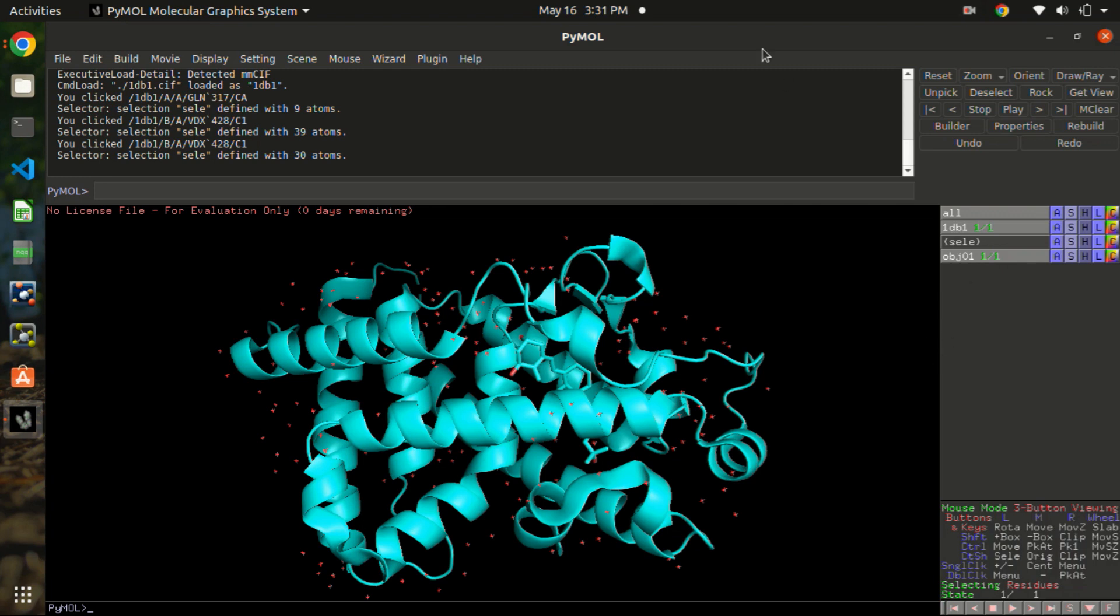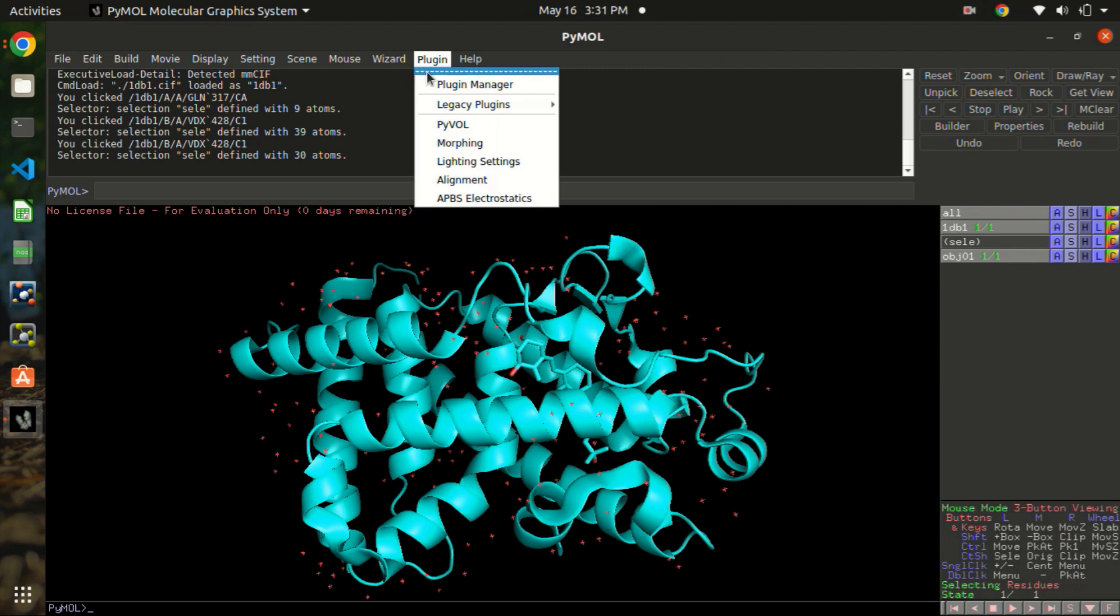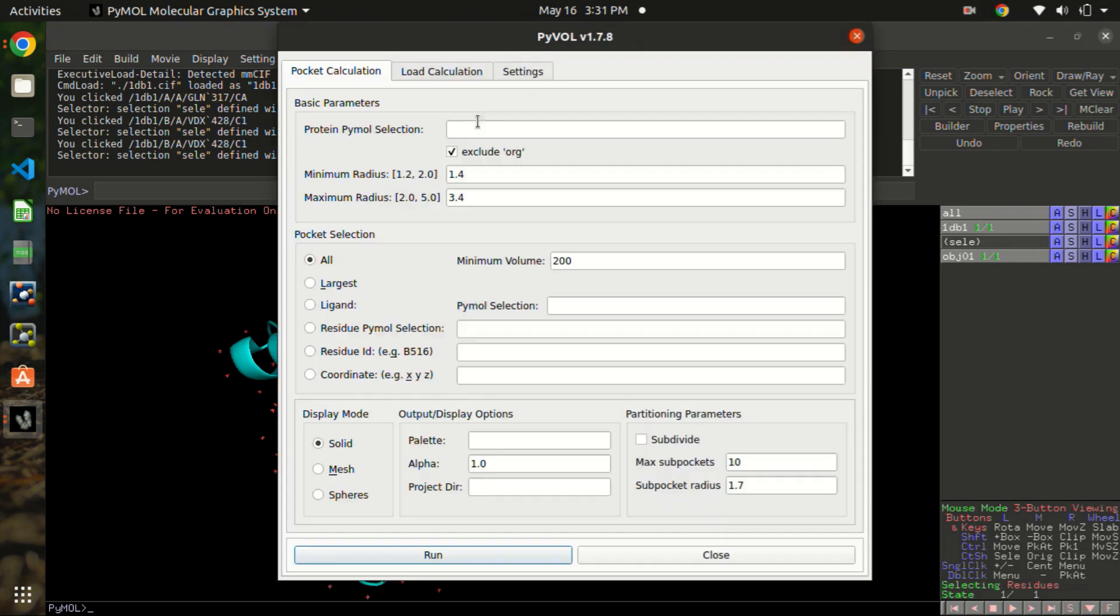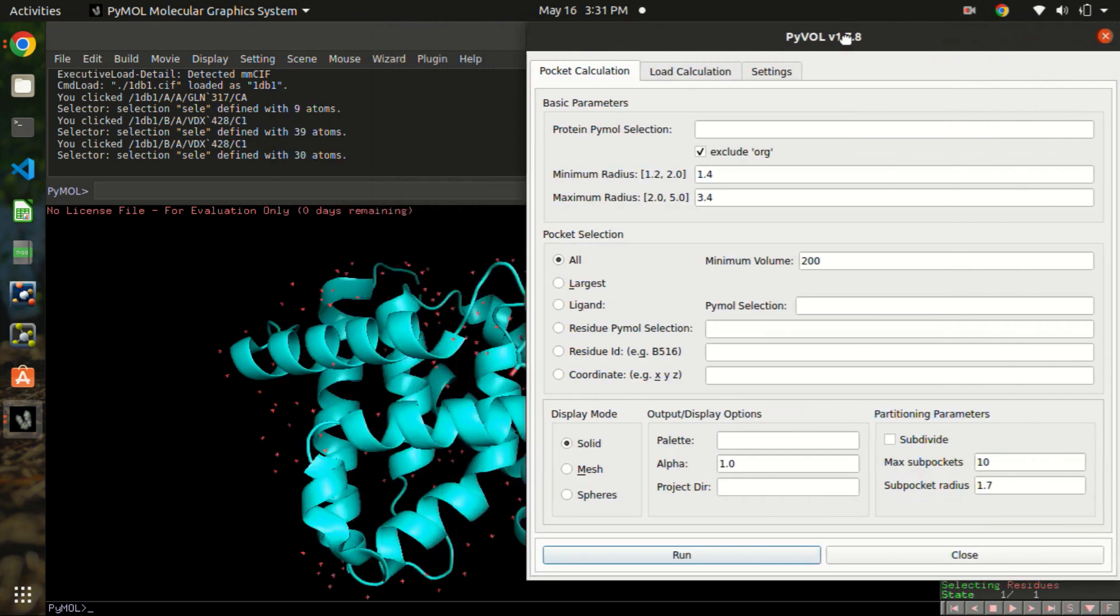So now let's go to the plugin manager. You will see if you have successfully installed PyVol, you will see PyVol in here and click on that. Now you see a window where there are the basic parameters: protein, PyMOL selection. Write the name of the protein, that is 1db1.